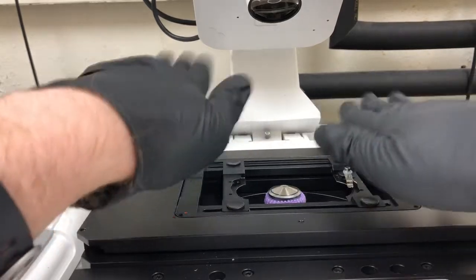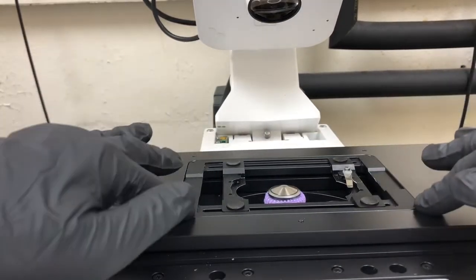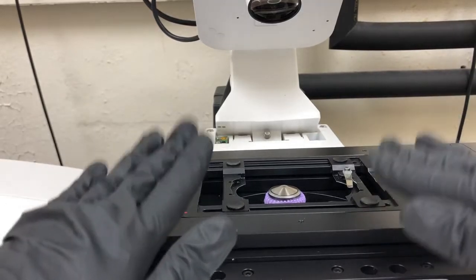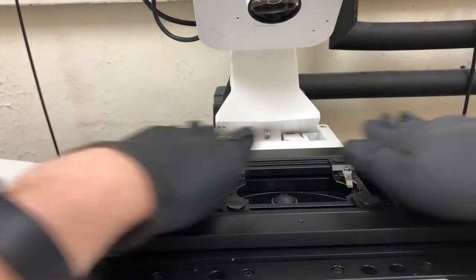If we touch it, it should not wobble and it should not suddenly go down — it should be firmly in place, which this one is. But what happens if it's not? If it's not, you want to first change the objective to the 10x.